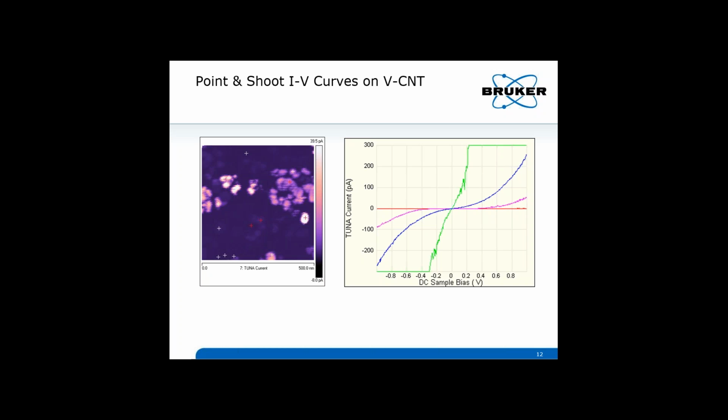In spectroscopy mode, the feedback is switched to contact mode. A constant deflection is maintained by the feedback while the sample bias is ramped. This assures the tip-sample contact is fixed while the IV curve is taken. The resulting current through the sample is plotted versus the applied bias.